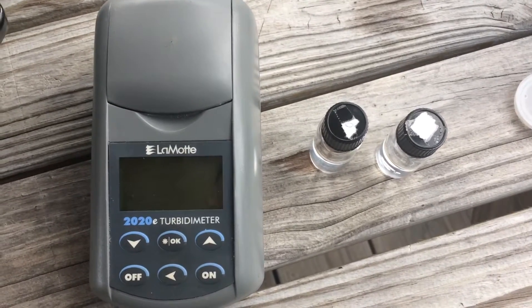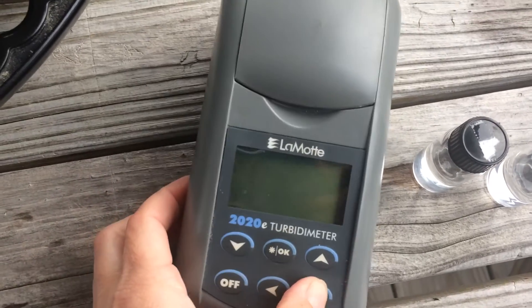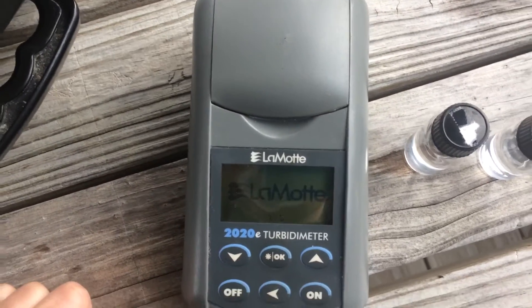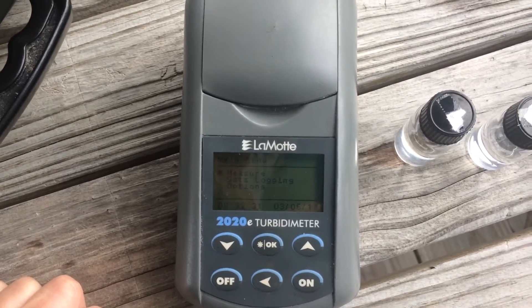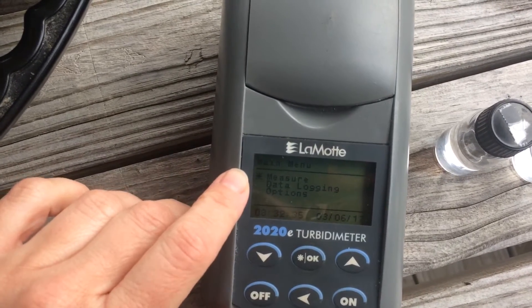This video is about calibrating the turbidity meter. Start by turning it on. Read the machine — it has an asterisk next to measure.